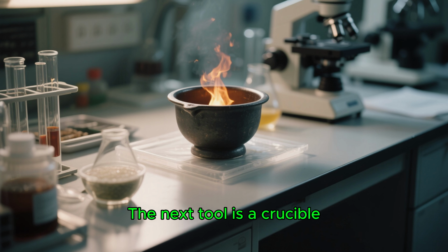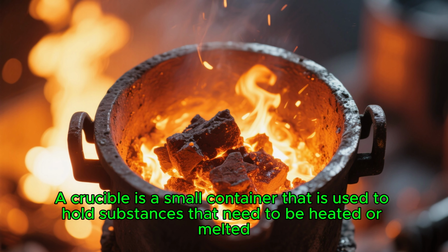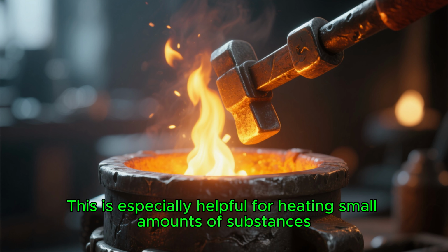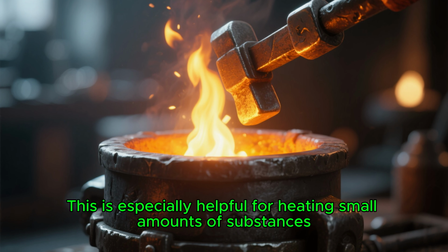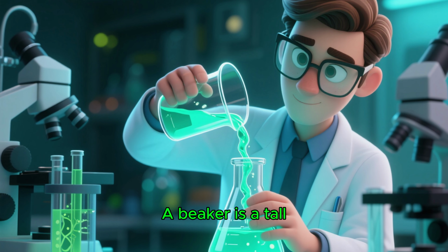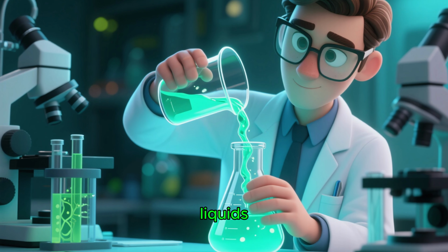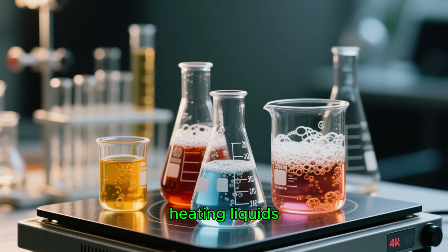The next tool is a crucible. A crucible is a small container that is used to hold substances that need to be heated or melted. This is especially helpful for heating small amounts of substances. The next tool we're going to talk about is a beaker. A beaker is a tall walled container that is used to hold and mix liquids. This is especially helpful for holding solutions and heating liquids.